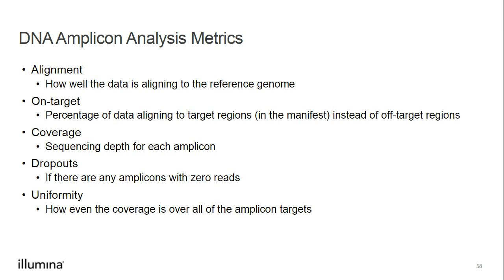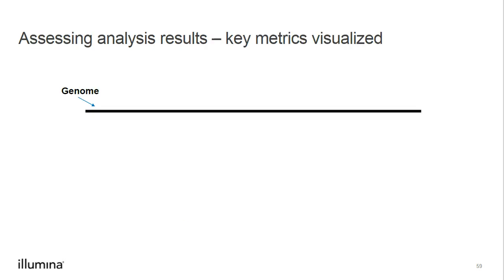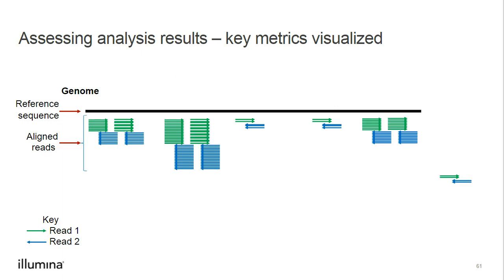So those are great definitions, but let's quickly visualize what each of these metrics mean. First, we need a reference genome. The genome will be used as our reference sequence, to which we align our sequencing data, or our reads. Here, I have added reads to our schematic. The aligned reads align to the reference sequence. Unaligned reads do not align to the reference sequence.